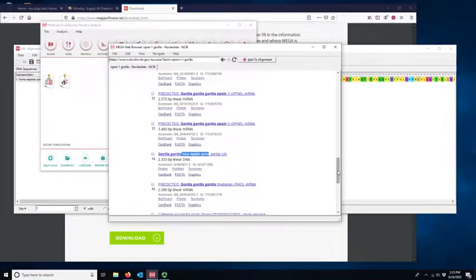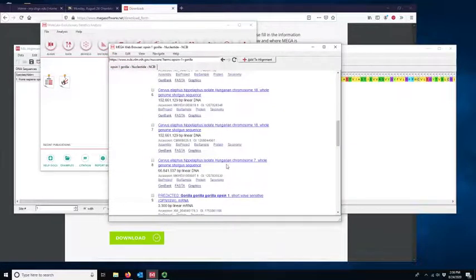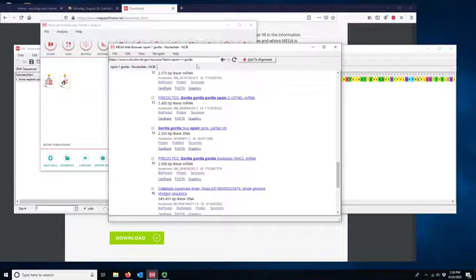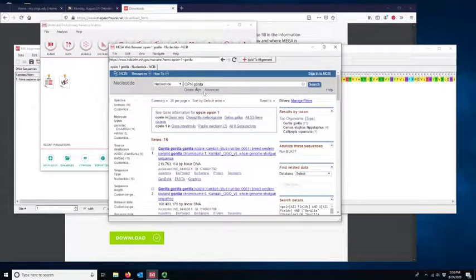If a gene has an abbreviated name, that can actually be helpful. So the abbreviation for this one is OPN, opsin 1. And let's see, I think that there's no space between the 1 and the end of it. Let's see, where's the abbreviation for 3 there? Yeah, OPN, OP5. So let's do opsin 1. And let's do a different search. So keyword searches can be useful, but they can also be a little bit problematic.